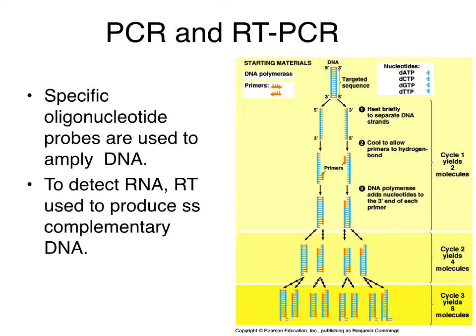Ingredients needed to copy DNA include the template or target DNA, or a complementary DNA copy of RNA made with reverse transcriptase, sequence-specific primers, deoxynucleotide triphosphate building blocks, and a thermostable polymerase with an appropriate buffer. Design of primers is crucial in order to ensure specificity. Several thermostable polymerases are now on the market.